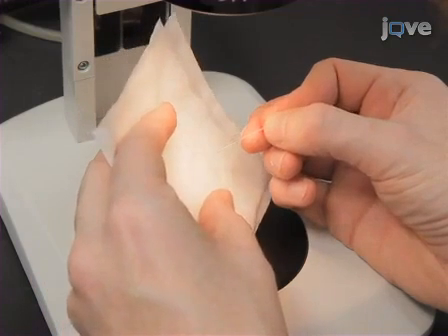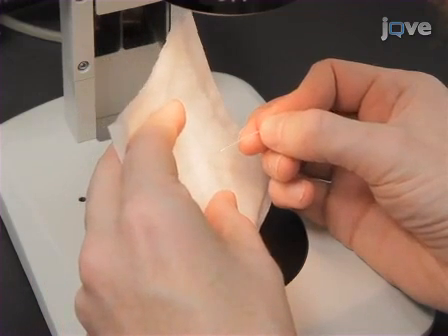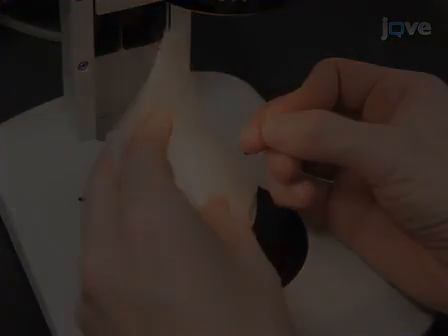Blend the tips of freshly pulled glass needles by pressing them through a kimwipe in order to create a stout tip with a larger pore diameter.